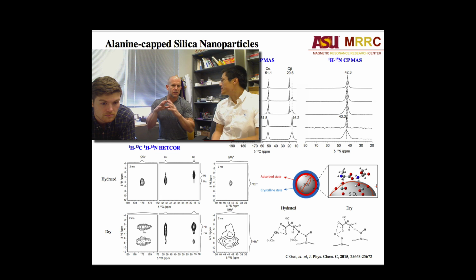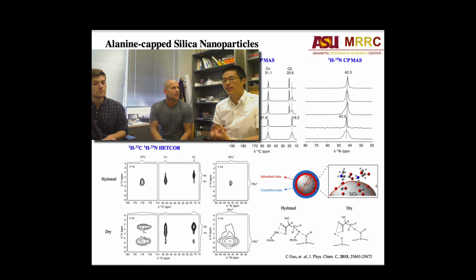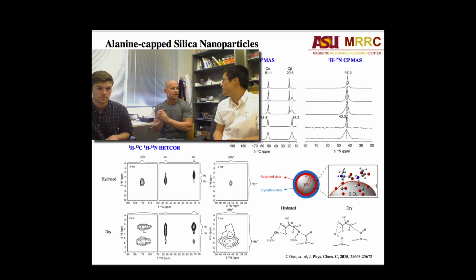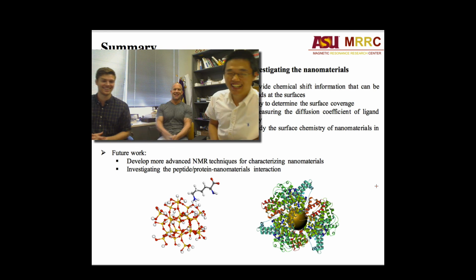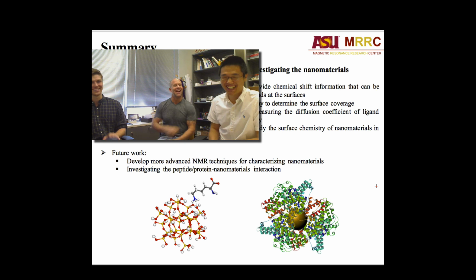Are these silica nanoparticles that you're making with an alkoxide method, like a TEOS method, or is this fumed silica that you're buying? What is the kind of silica you're using? We just directly purchase this type of fumed silica particles. Okay, so it's not really discrete nanoparticles. It's more of this typical fumed stuff, probably out of silicon tetrachloride or something. Yes. Okay. Any other questions while you're here? No, before we move on, I'm trying to get the context from here. Oh, and we're now at the end. Okay. That's it.